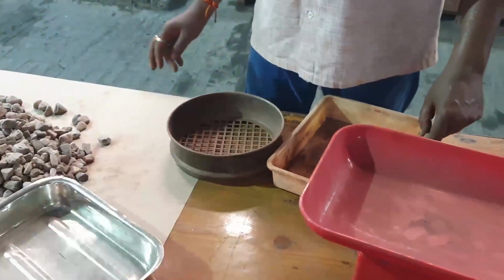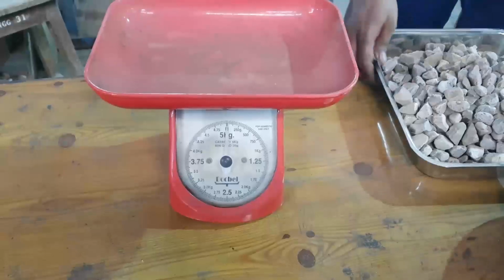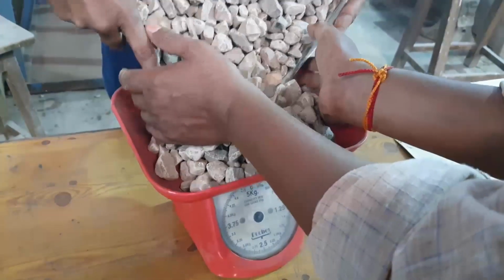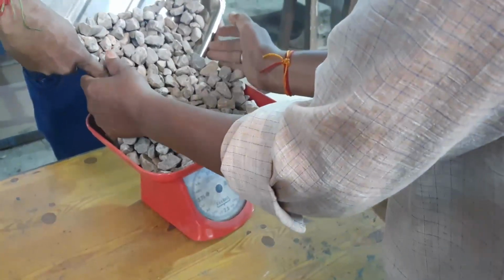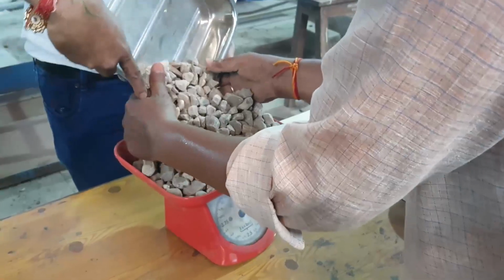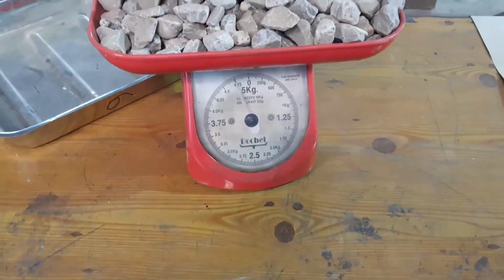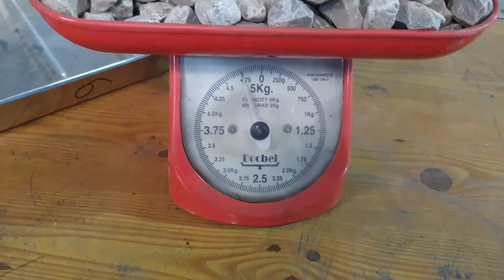Now we will take the weight of this plus 10 mm limestone. Now the weight is 4.75.